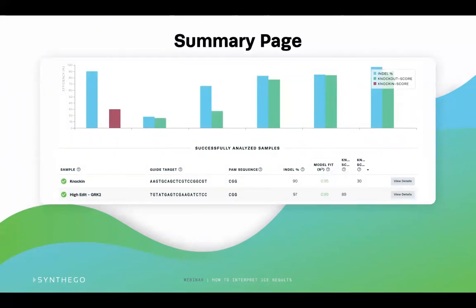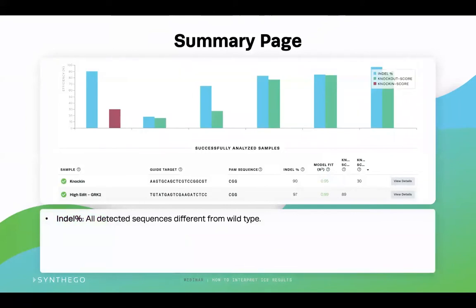The first screen after ICE analyzes the sequencing data from your samples will be the summary page seen here. You can see the list of all the samples uploaded to ICE below the bar graph. If you uploaded multiple samples, you can scroll through to find any given sample. As you place your mouse over a sample of interest, it will be highlighted in the bar graph above to display how that sample compares to other samples you uploaded. The blue bar represents the indel percentage, which is the percentage of sequences that contain some type of CRISPR edit in that sample. The indel percent includes all detected sequences that are different from the wild type — all insertions and deletions present in the samples — and gives a general indication of editing efficiency.